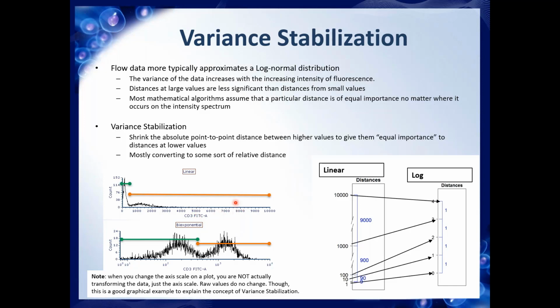And if you have a peak here, it will be even broader. Okay, this is how the instruments are defined. So this is also why you basically always apply a log scale, a biexponential, or a hyperlog scale every time that you plot a fluorescence marker.